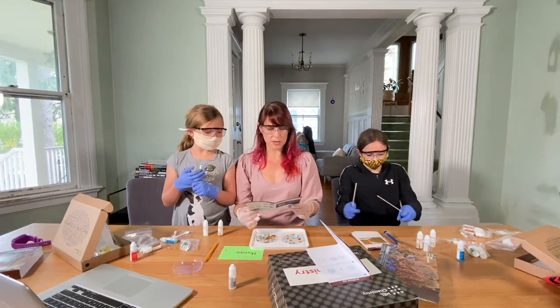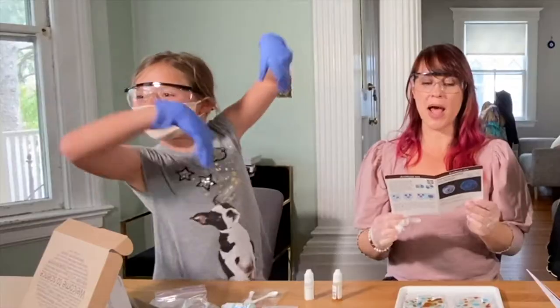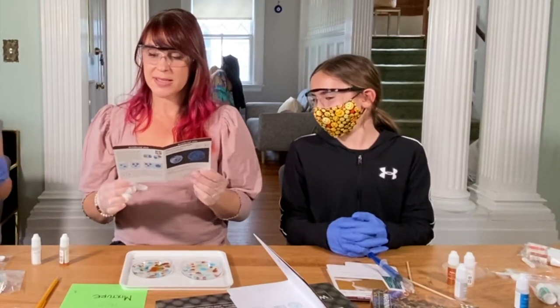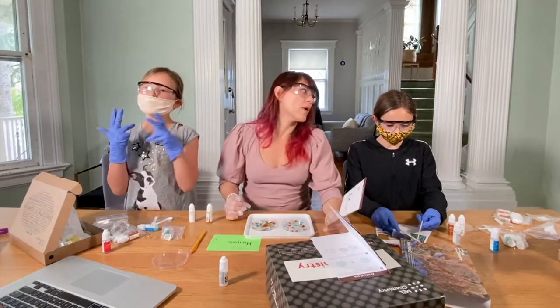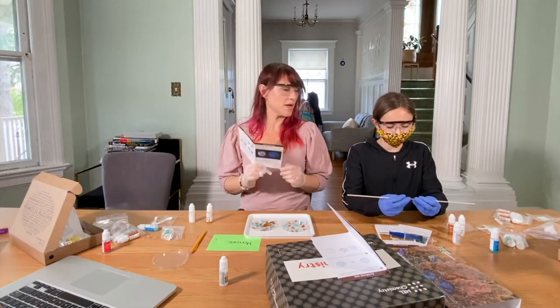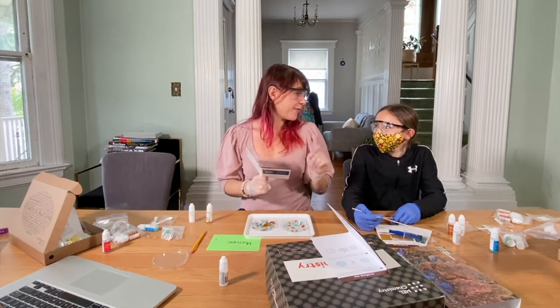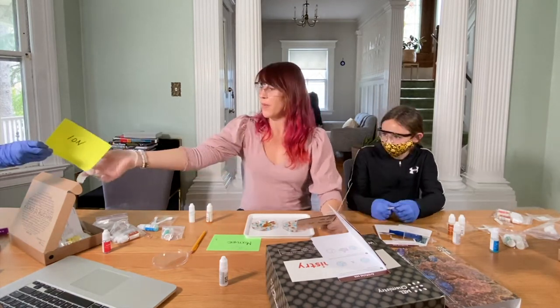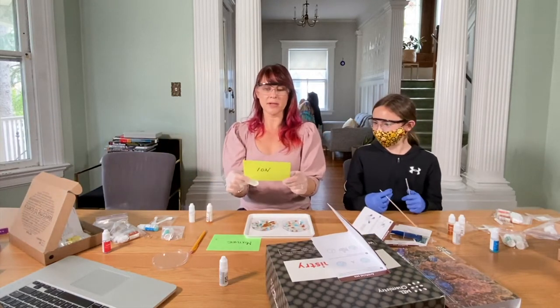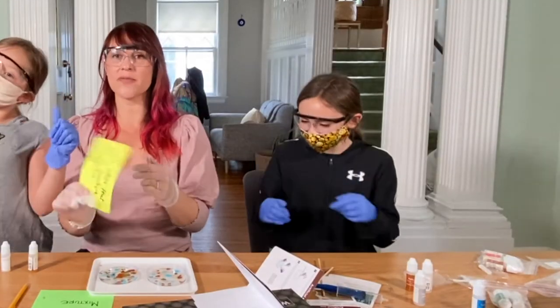Let's read what happened. Focus up, people. An ion exchange reaction occurs between the sodium silicate — we'll get into ions this week. Run over there and see if you can find the word ion. I think I know what it is. Positively or negatively charged atom. Did Wonder Mother get it right? I think she did. An atom that has a positive or negative charge.